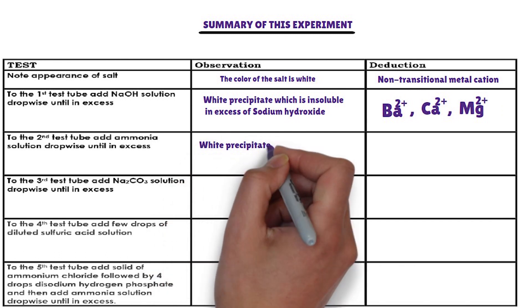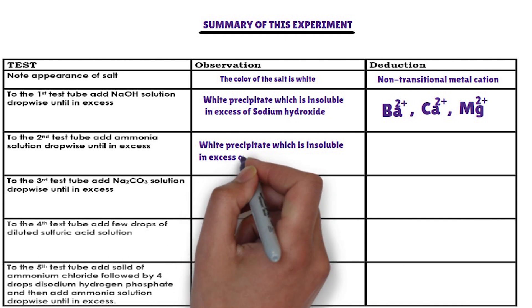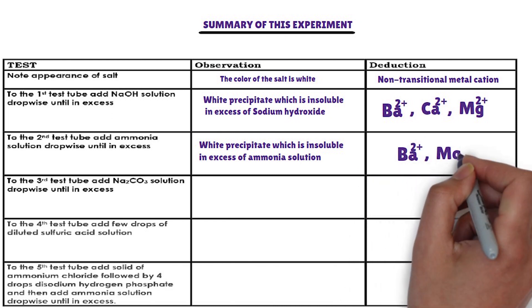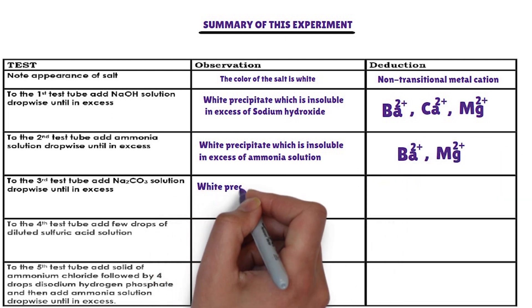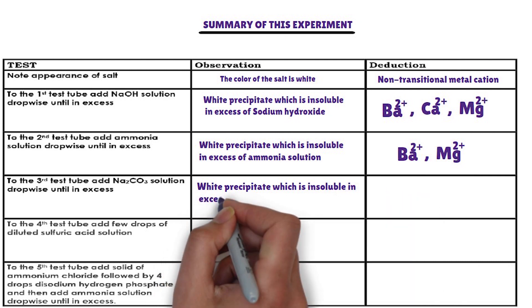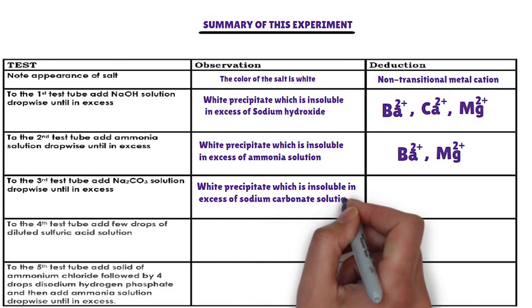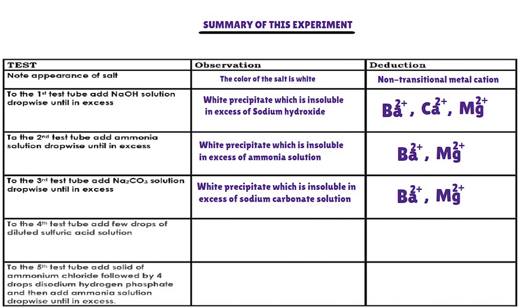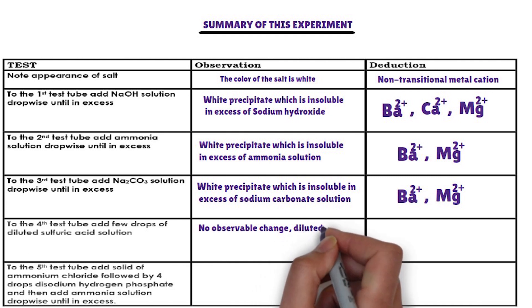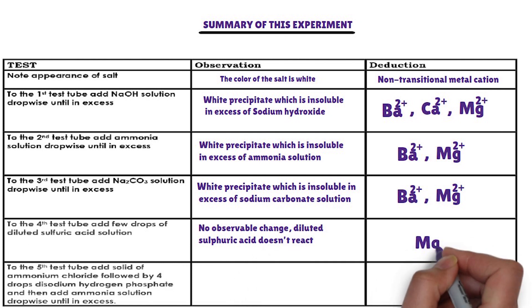In the second test tube, diluted ammonia solution is added. The cations from the above list that form a white precipitate with diluted ammonia, insoluble in excess, are barium ion and magnesium ion. In the fourth test tube, diluted sulfuric acid is added. The cation from the above list that does not react with diluted sulfuric acid is magnesium ion.